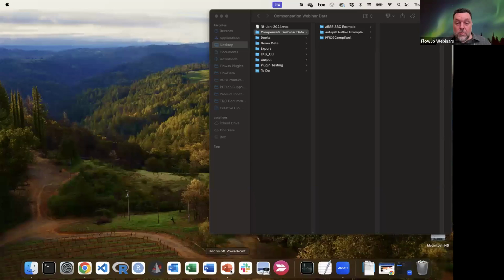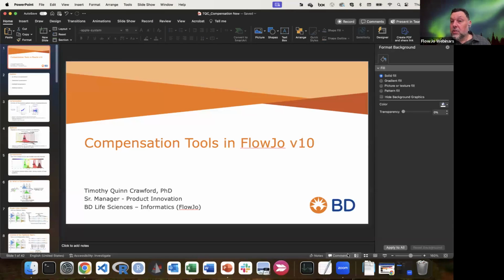Let's go ahead and get started. I'm going to share my screen and we will go ahead and go into full view mode with this presentation on compensation tools in FlowJo version 10. Again, I see people coming online. Welcome to the conversation here. We're going to talk about compensation in FlowJo and go through all the tools and show you some of the bells and whistles available to evaluate how to create good compensation and evaluate whether that's appropriate for your panel design or your instrument setup and such. So let's go ahead and get to it.